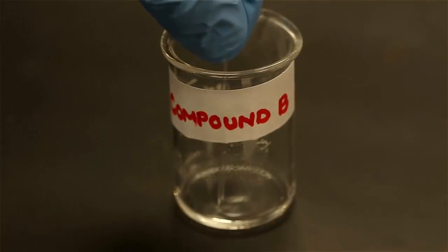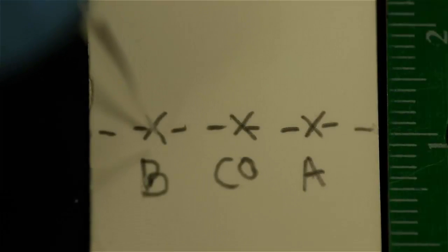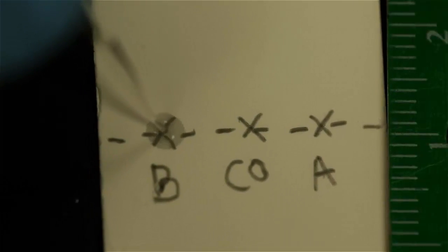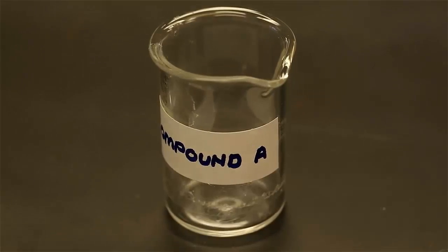Using your microcapillary, dip the end into the diluted sample, then quickly and carefully tap onto the designated lane at the dotted line. Do this for both compound A and compound B using one capillary per sample. Your co-spot will have one application of your compound A and compound B. Try to have all three spots equivalent and small in size.